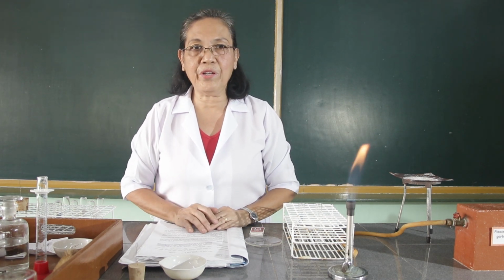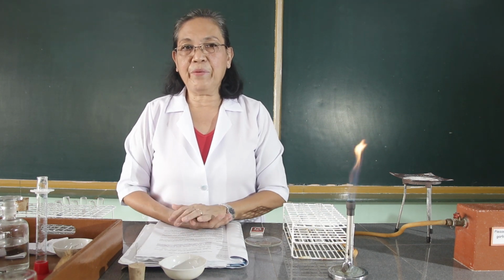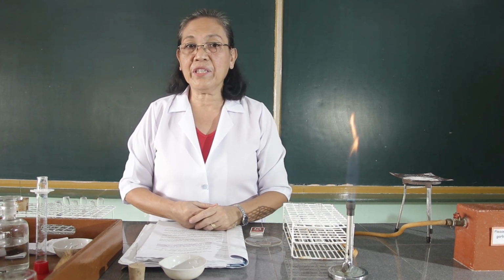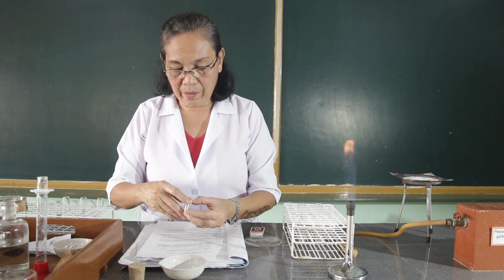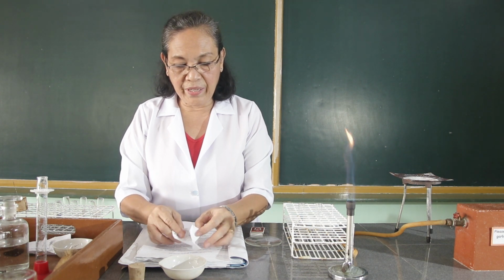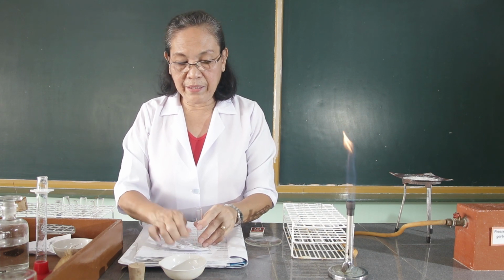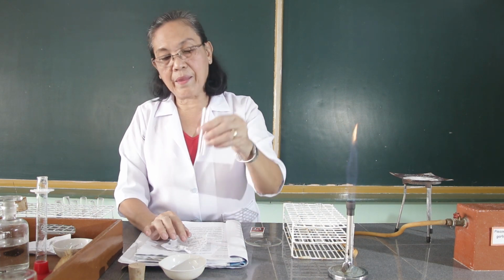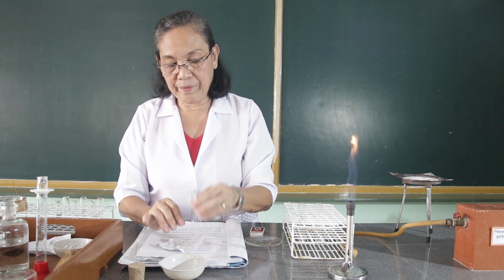For the third ion to be analyzed, it is the ammonium ion. So we're going to use here the ammonium carbonate. Again, we're going to dissolve it in 1 ml of water and add it with 1 ml of hydrochloric acid. This is the ammonium carbonate. Let's get a pinch of this. Place it into the vial. Put a little more.